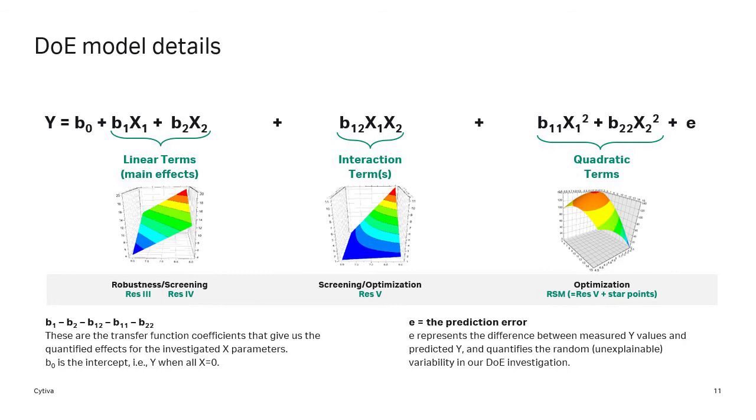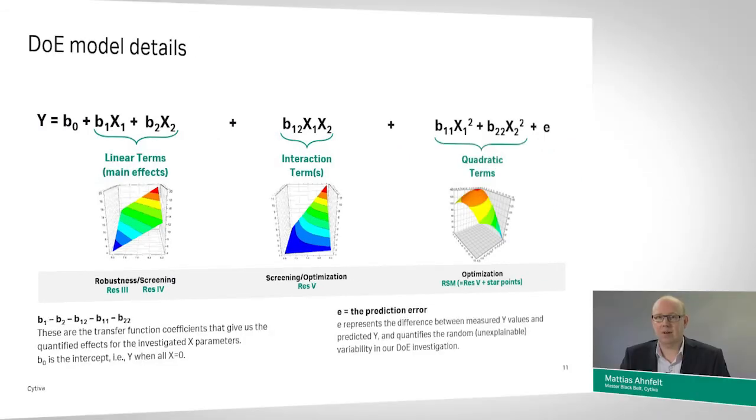Starting from the left cartoon, if we start out with only a linear model in x1 and x2, we get a response surface that describes the process as a flat plane oriented somewhere in the multidimensional space. That would be the most basic, the most simple model, and the one that we can have good statistical support for in the least number of experimental runs.